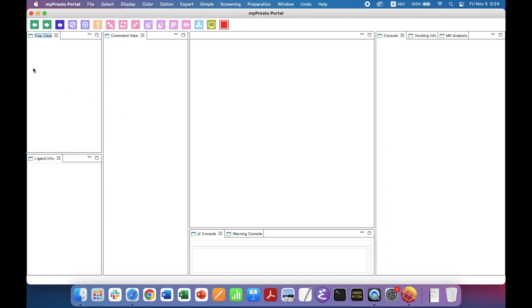This is myPresto portal. It has many views, like tree view, ligand view, command view, 3D view, JV console, warning console, information console, docking info, and MD analysis.